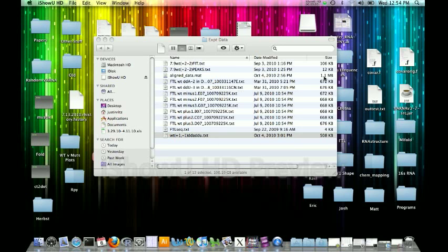Welcome back. At this point you've already aligned and assembled all your data and you would like to do a full ShapeFinder analysis using the ShapeFinder software.